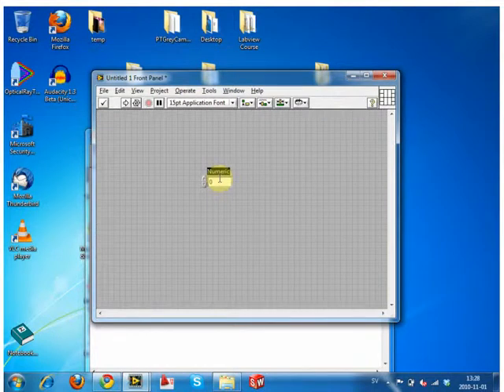Then hover over one of these connectors and click with your spool of wire. So left click the spool of wire over one of the boxes. It should go black. Then click somewhere on the control. If we left click on there, you see that this has now changed color. It's now orange because this is a double precision number, and this is now the input.